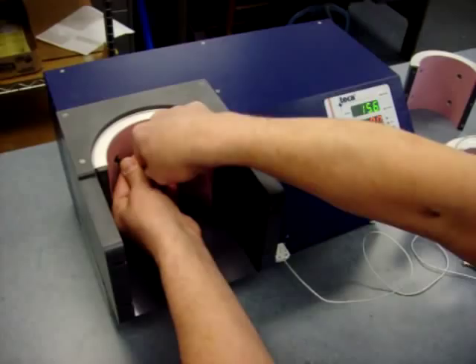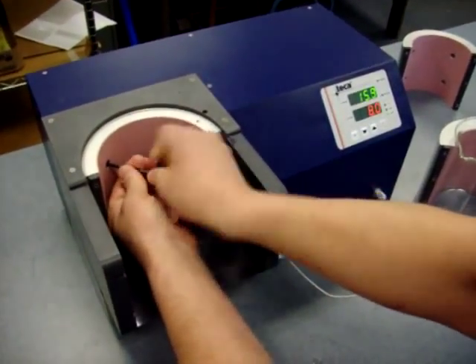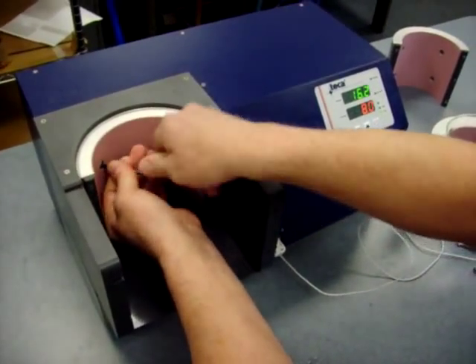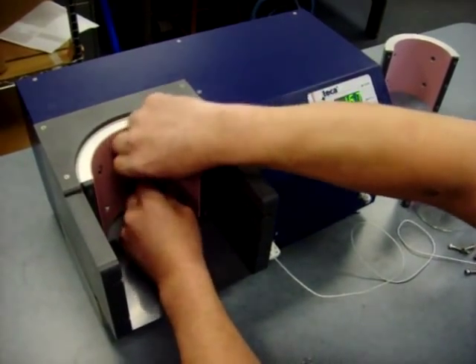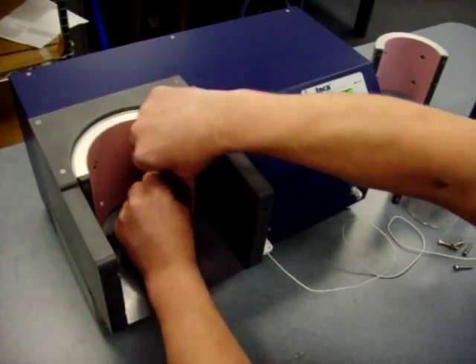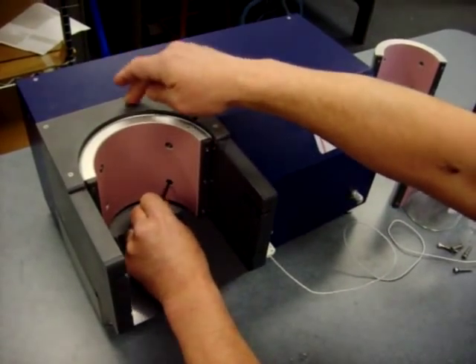Do you need to use the remote sensor? No, you don't need to use a remote sensor. Back here there's another sensor built in, but given thermodynamics and heat transfer, that's not reading the fluid temperature.